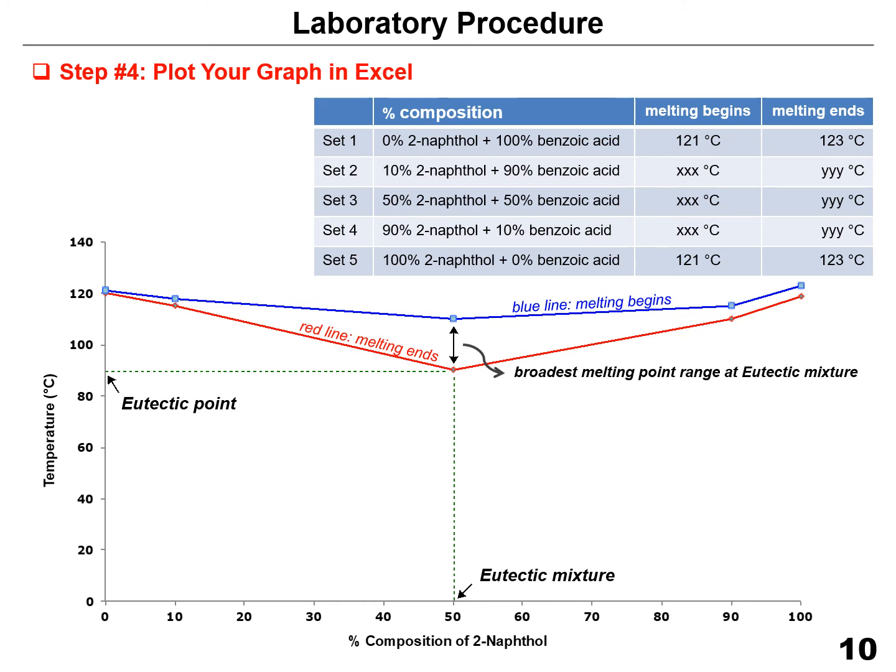That's why we say the melting point of a pure sample is always greater than the melting point of a contaminated sample. And the lowest temperature you'll get from the lower line is the eutectic point, which is the lowest point created from the mixture of these two substances, 2-naphthol and benzoic acid.